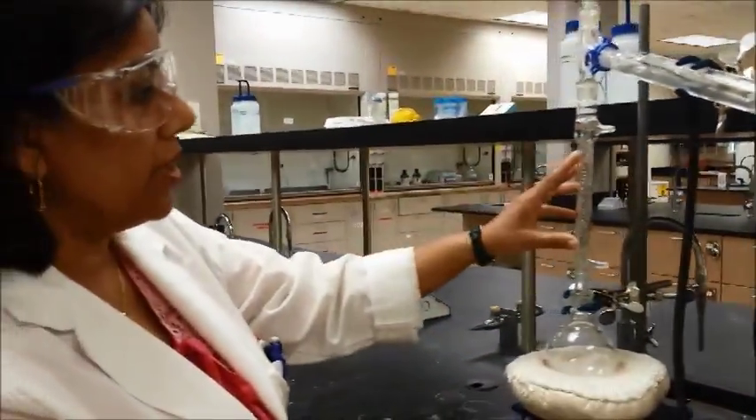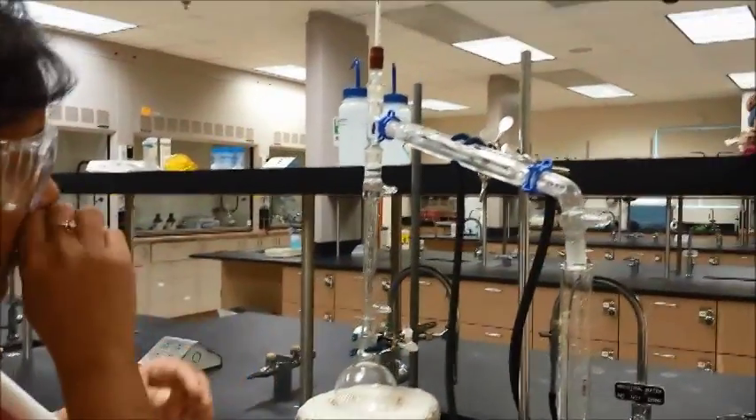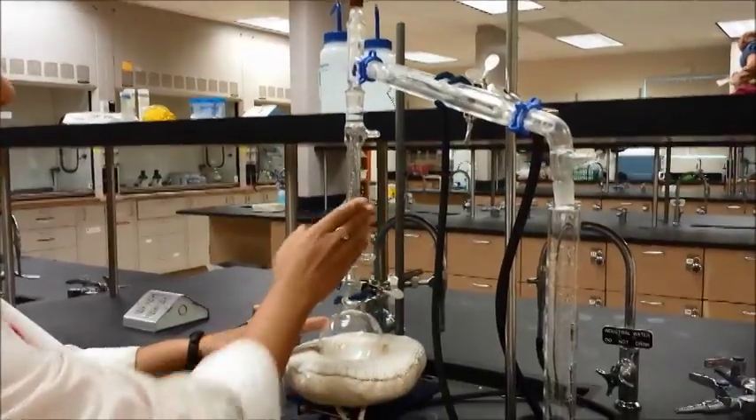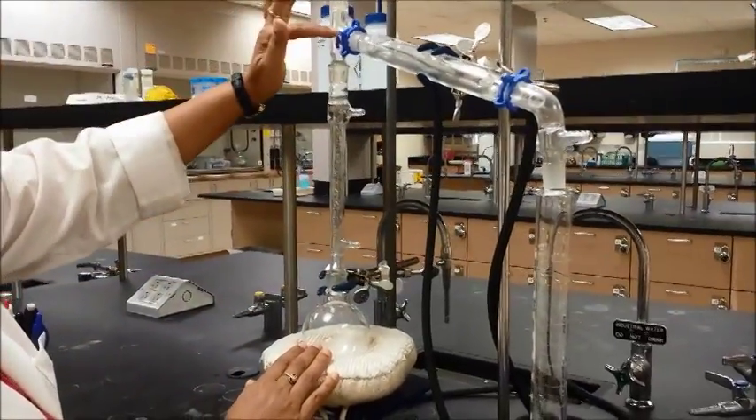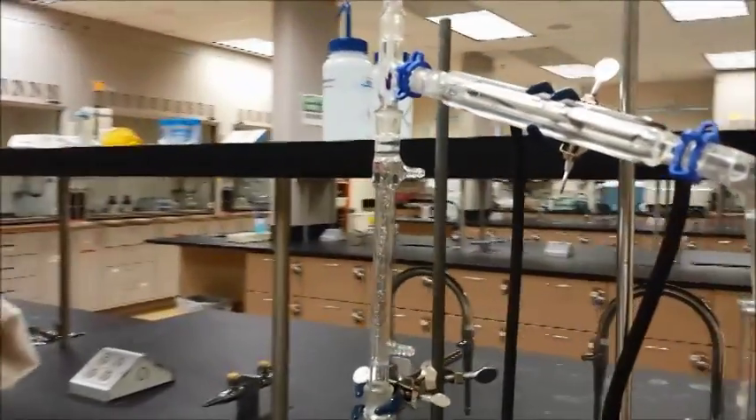All we have done is added the fractionating column, which really elevates everything up in general. Here is your fractionating column — the thermometer goes here, and again the bulb should be right at the point where condensation will start taking place.